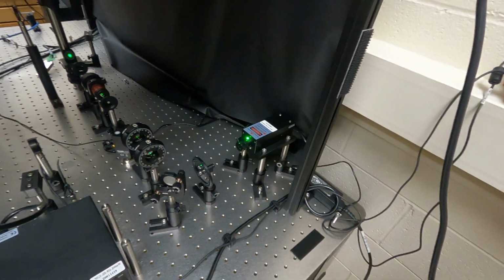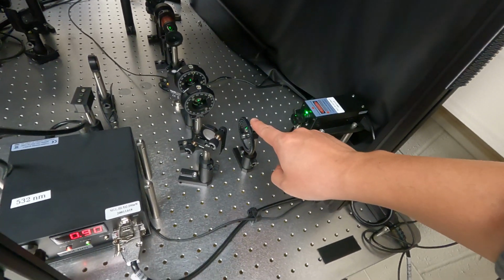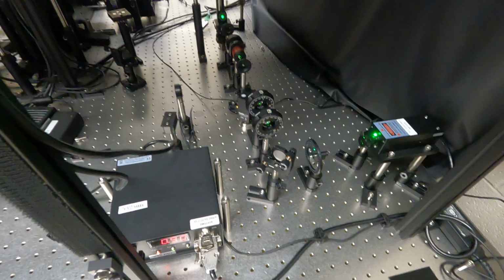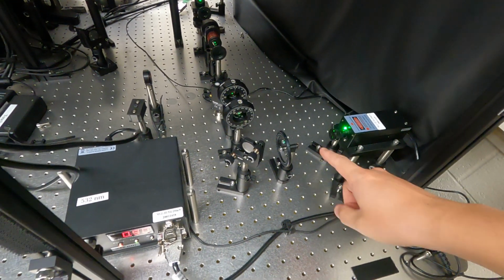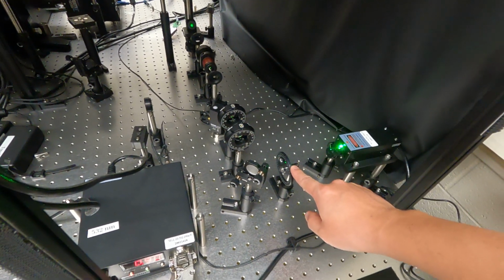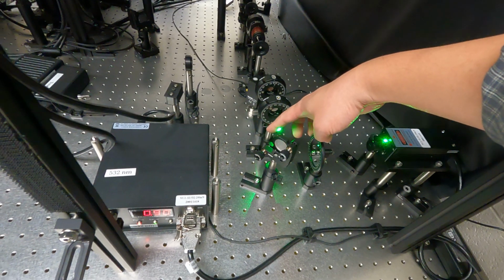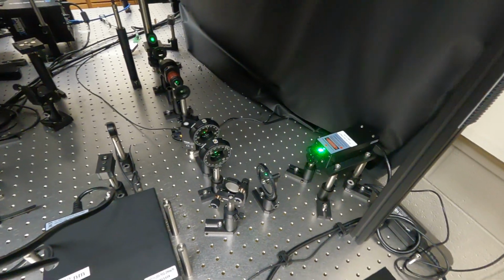Once the laser comes out from this laser unit, we have a continuous neutral density filter wheel. The purpose of this wheel is to adjust the power of the laser beam that can reach the microscope body. If you rotate this dial, the intensity of the beam coming out will change. We use this to control the amount of laser used for the experiment.